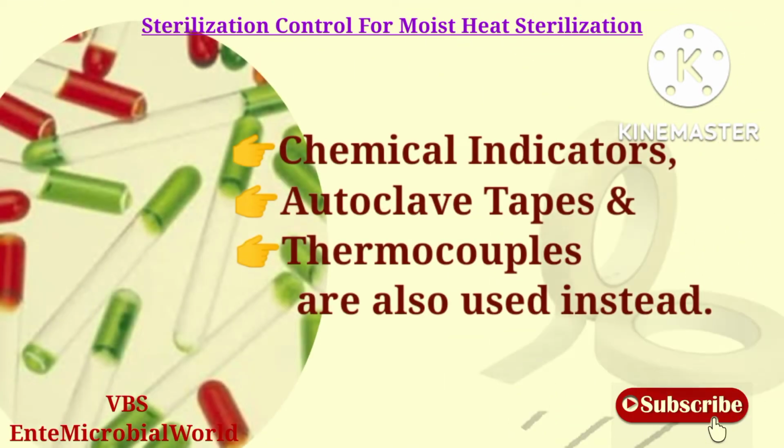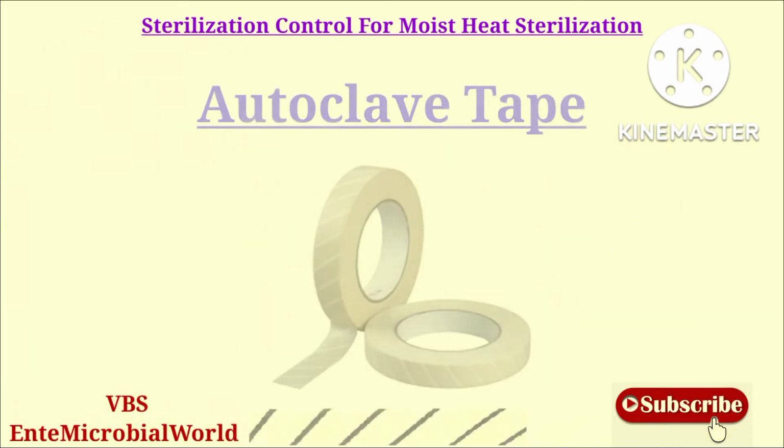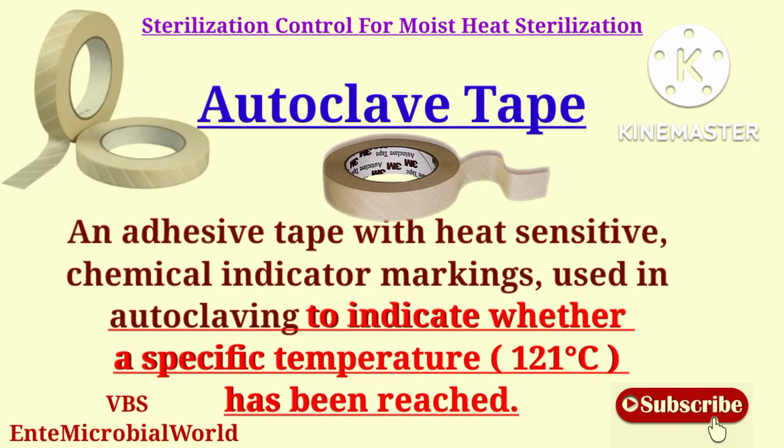Chemical indicators, autoclave tapes and thermocouples are also used instead. Autoclave tape. Autoclave tape is an adhesive tape with heat-sensitive chemical indicator markings used in autoclaving to indicate whether a specific temperature has been reached.